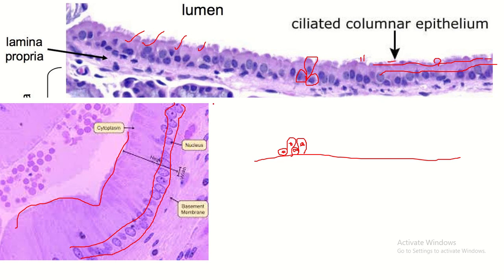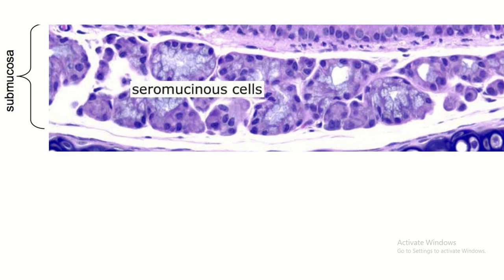The lamina propria contains loose connective tissue. You can see that the number of cells is greater in loose connective tissue and the extracellular matrix is less. The term lamina propria is frequently used in histology and refers to loose connective tissue which contains a large number of cells but a lesser amount of extracellular matrix.